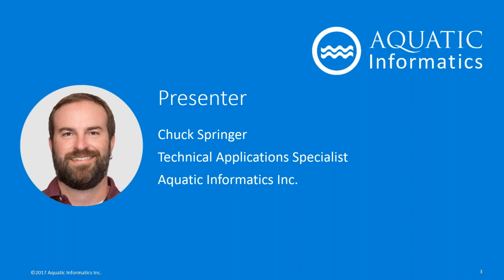Chuck's going to pick up at the second half of this webinar after a poll where he's going to demonstrate how to use a spreadsheet tool to manipulate some pH and chlorophyll data. And then he'll also show a commercial tool to manage and follow those same processes, just with a different workflow.